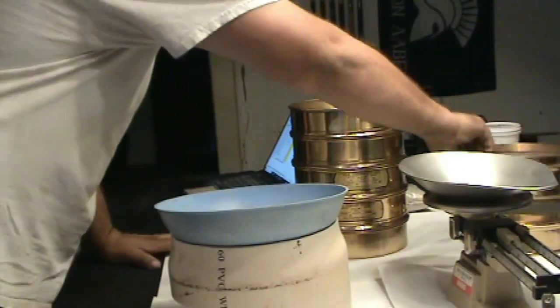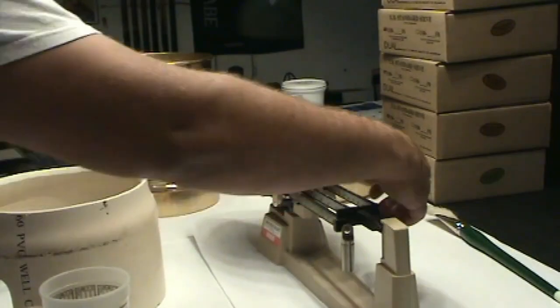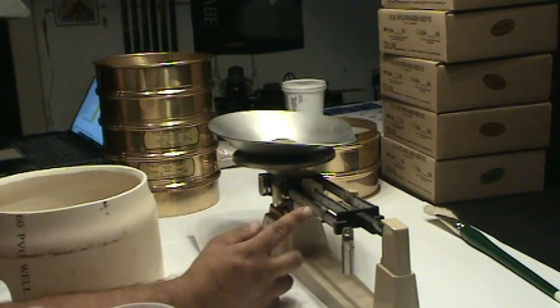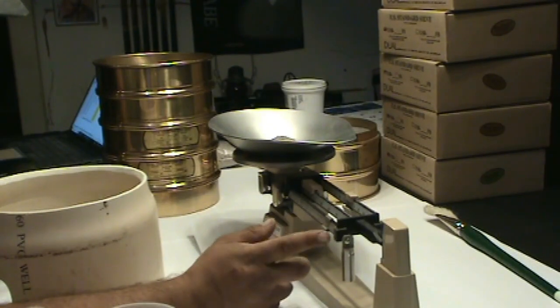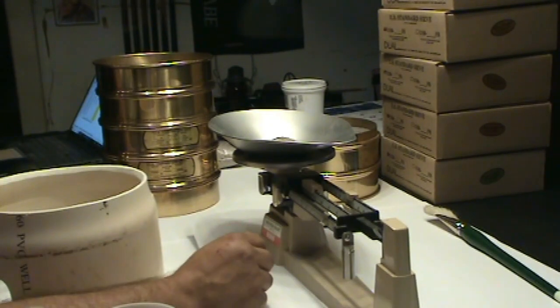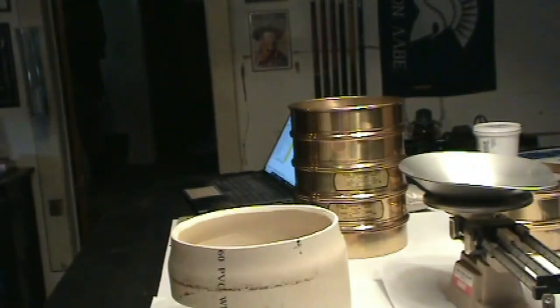Industry consensus is that the median filter pack grain size should be 4 to 6 times the median aquifer grain size. When the gradient of the aquifer grain size is relatively uniform, the filter pack size should be reduced. Sieve number 14 retains 68.3 grams or 20.7% of the total.